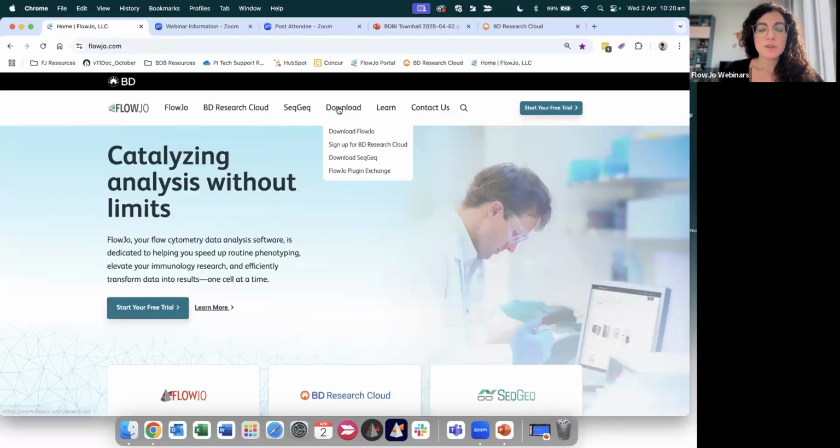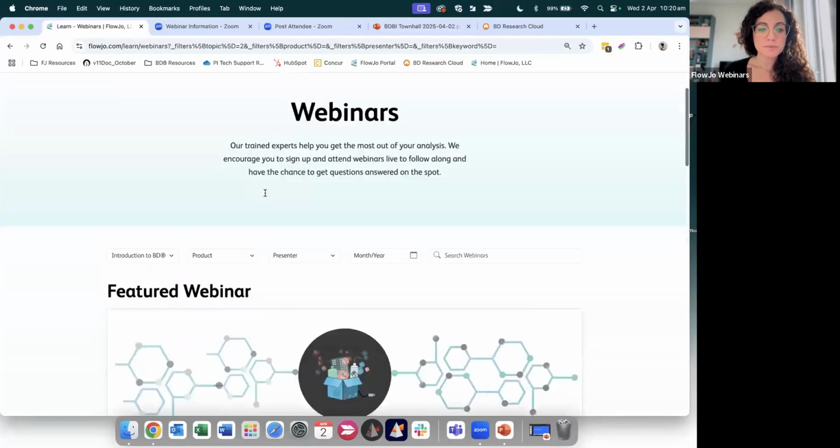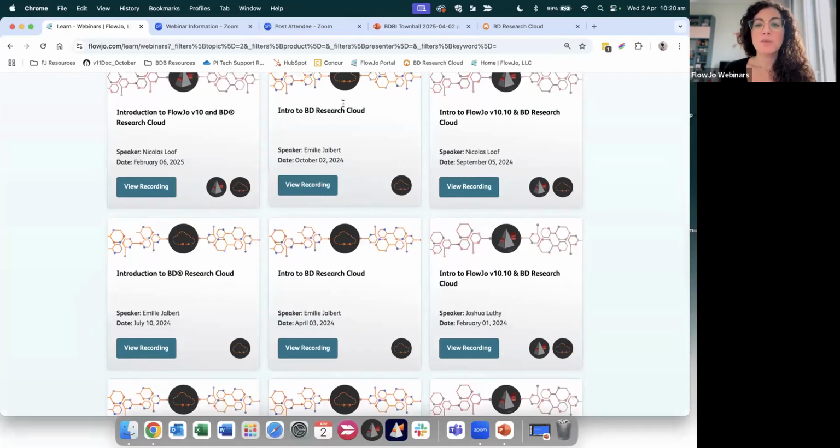But one thing that I wanted to show you before jumping into the cloud directly is the learn area and the ability to learn everything regarding BD Research Cloud. If this is your first webinar, you will find extra information within webinars right here. You can just navigate through introduction to BD Research Cloud. And then right here, you will find specific webinars only on BD Research Cloud, or webinars that cover both introduction to BDRC and FlowJo, introduction to FlowJo.